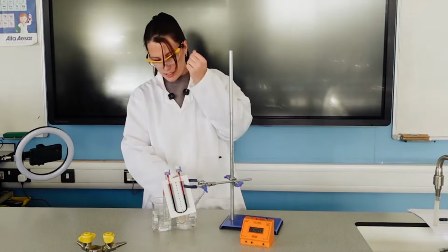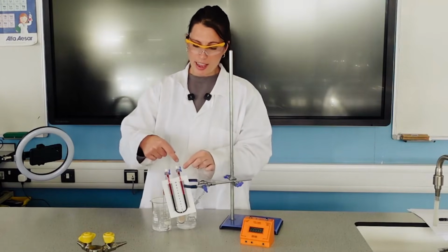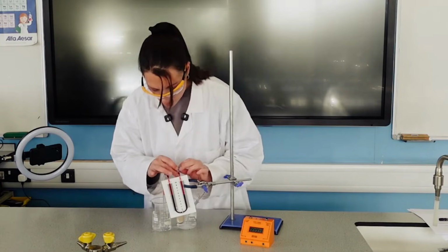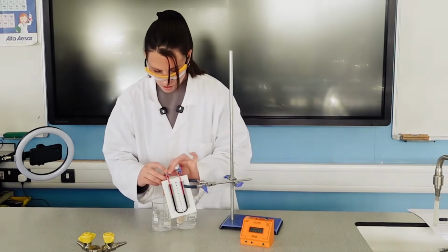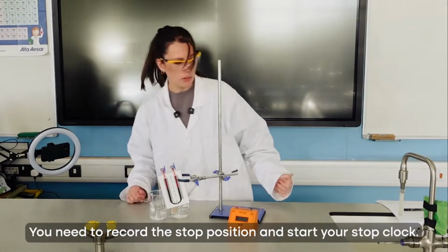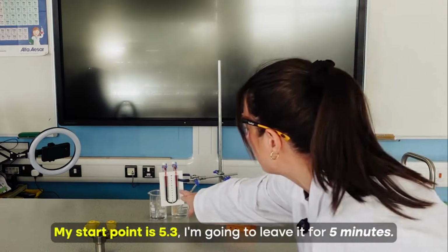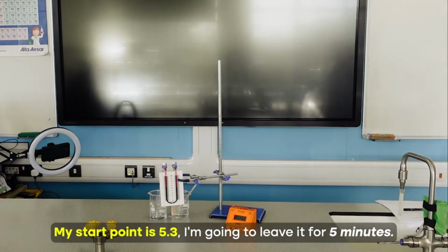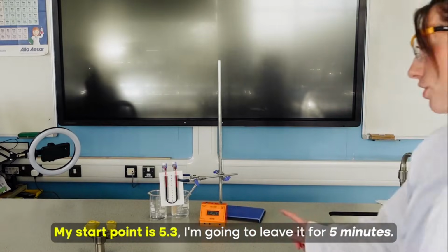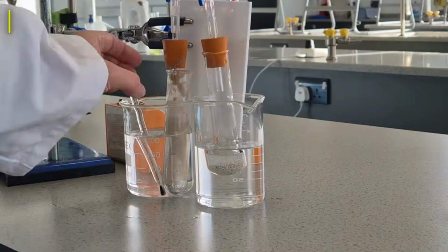So now we've left it to acclimatise and I can see it's bubbling away. We can now open up the valve so the gas is now entering into the chamber as well. And we've got these screwed on, so let's open and open. And you need to record the start position and start your stop clock. And that's at 5.3. So my start point here is 5.3. I'm going to leave it for 5 minutes and we should see the coloured liquid moves up this way.